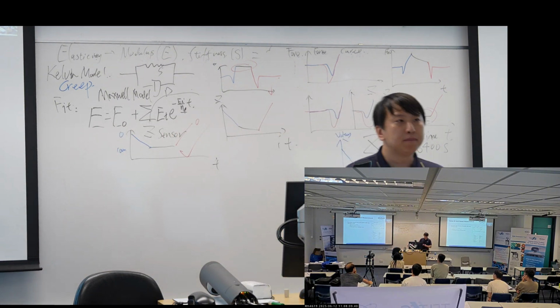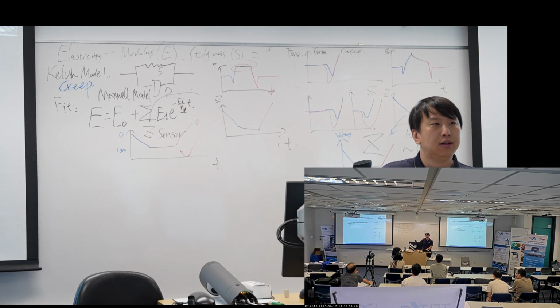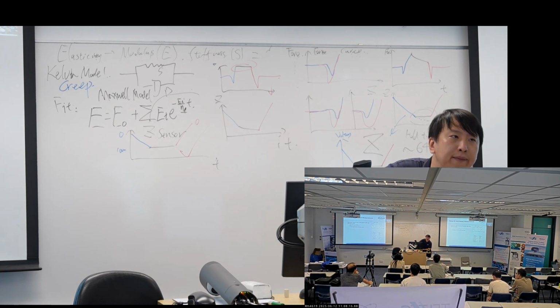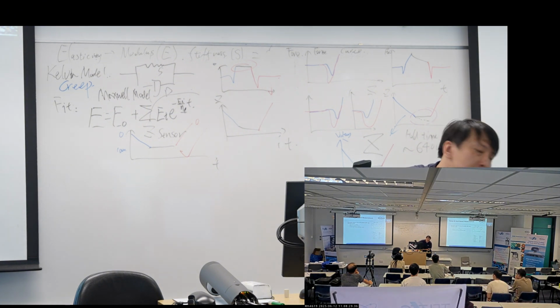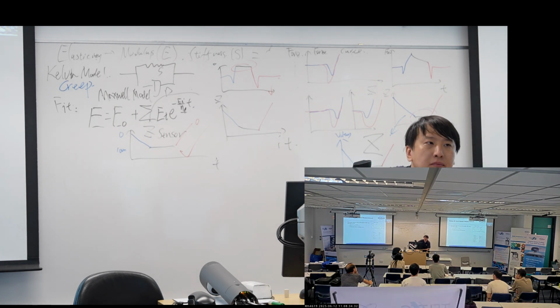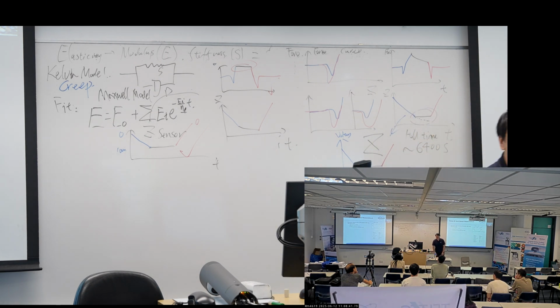Yes, I have a question. When we hold the Z sensor... Yeah. But because my sample's stiffness is getting smaller, the deformation of the tip, or we can say the strain, actually changes. But in an ideal theory model, the strain is kept the same. So yes, quite a good point. Yes, that's true.